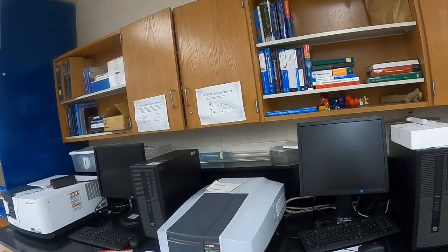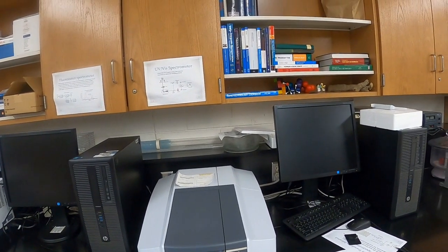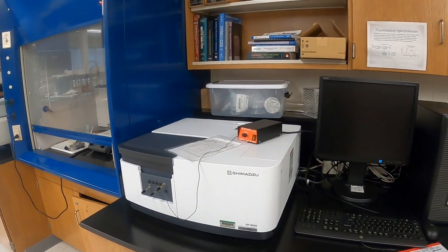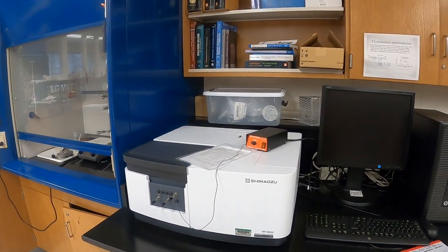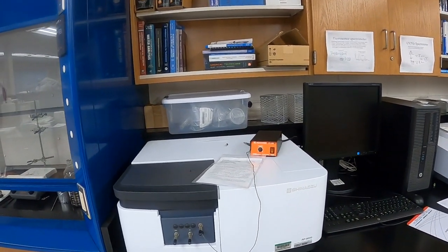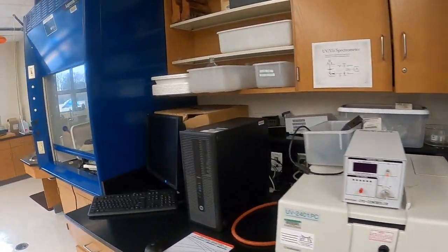A UV-Vis spectrometer can be used to very sensitively measure how much of a sample is present or how much of a chemical is present in a sample. You may have used a version of that in biology or chemistry called a visible spectrometer. And here we have what's called a fluorescent spectrometer, which measures the fluorescent properties of molecules, which is used quite a bit in projects related to nanochemistry, nanotechnology. Some students have begun doing projects related to studying the interaction of nanoparticles in a neuroscience type manner.